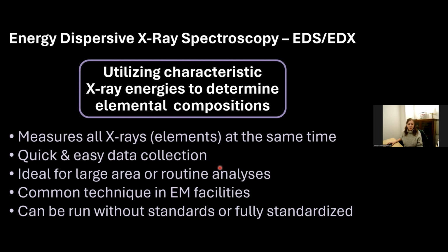It's very straightforward and really easy to understand, and quite a nice, easy one to see actually happening because it's so quick. It's great for large area or routine analysis. If you need to cover a big sample, EDS is the way to go for that. Or if there's something that you want to do repeatedly over and over again, it's really easy to set up user recipes that you can just rinse and repeat and collect huge swathes of data.